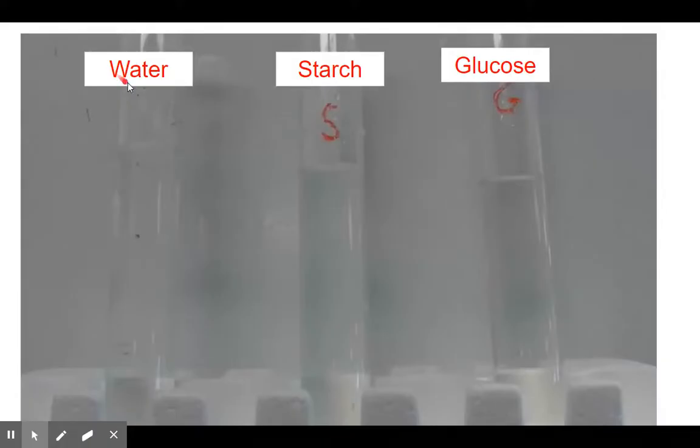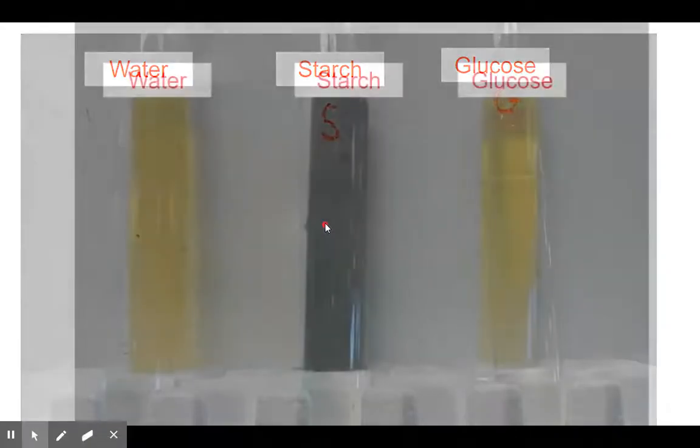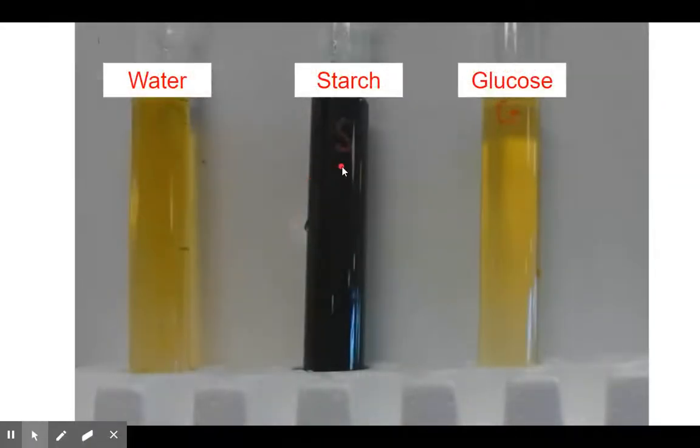Here again we have our water, starch, and glucose. We're going to add it to all three and test for the presence of starch. And you guessed it, guys, there is starch in the starch. So we know that this works great. The reason it's a lighter yellow color, just like before with Benedict's solution, is because it got diluted. But there is no lighter color here—that is clearly a dark purple or black color. So the starch indicator, iodine, works great.